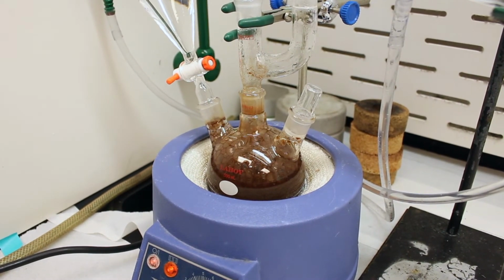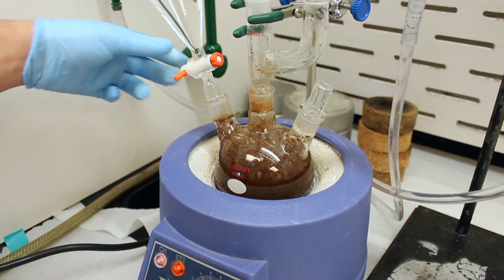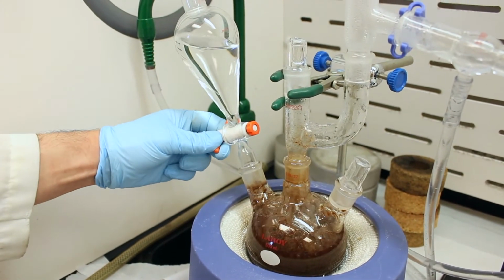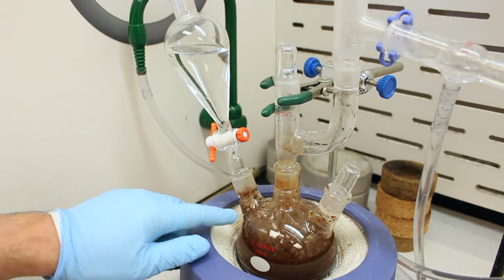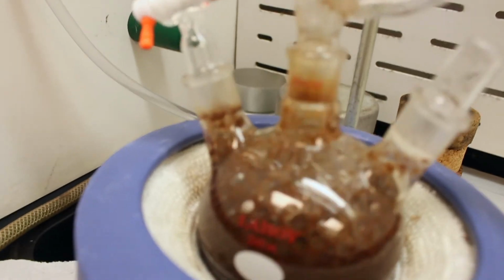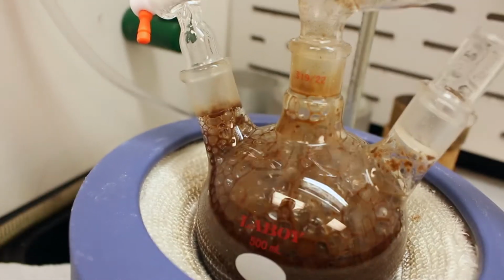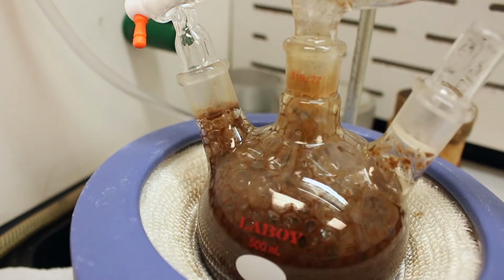So to compensate for the water in the distillate, we want to keep the amount of water in this flask constant. We're going to open up the sep funnel here to drip just a little bit periodically. It's kind of difficult to see, but maybe if you look right here, you can see a little bit of dripping from the sep funnel, which will help it boil. So we'll see you when we've collected all the distillate.